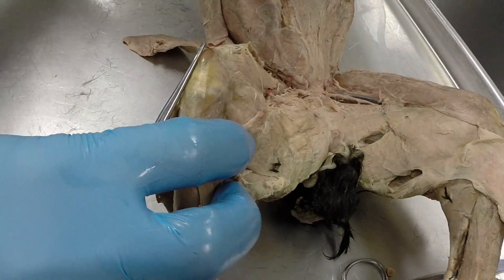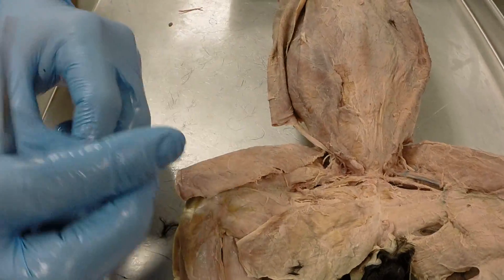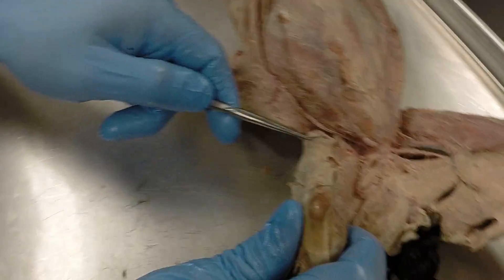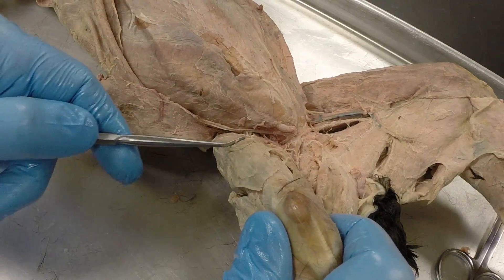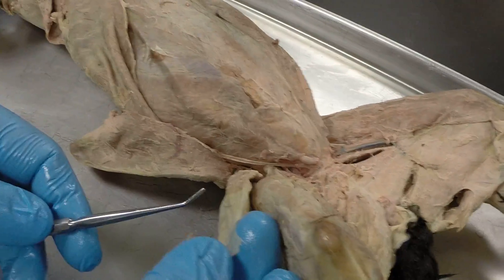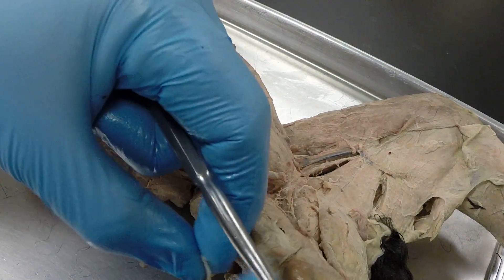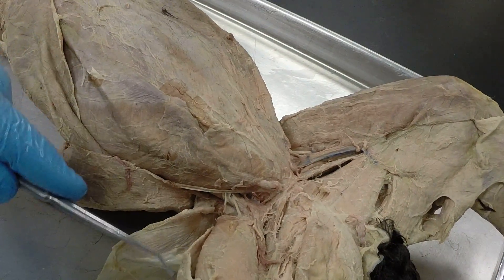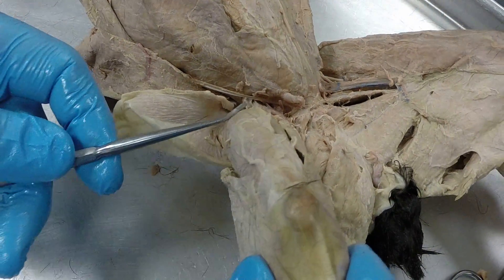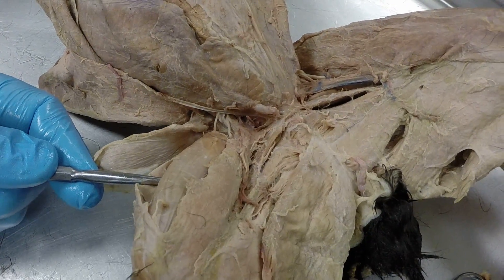Moving to the anterior part of the hind leg, we have a large sheet-like muscle — the sartorius. Peeling that back reveals the tensor fasciolata muscle, connected to a piece of connective tissue called the fasciolata. Peeling that back also reveals the quadricep muscles: the vastus medialis, the vastus lateralis, and in between is the rectus femoris muscle.